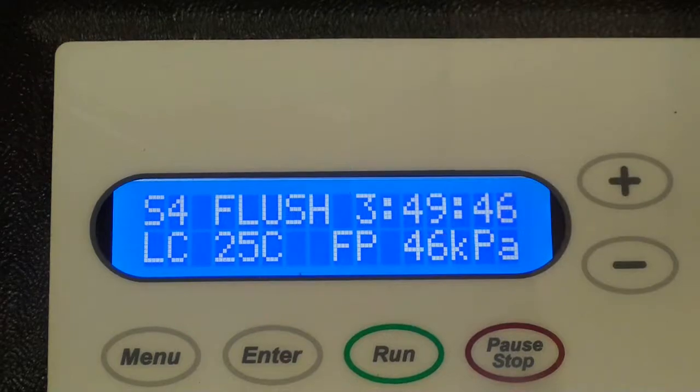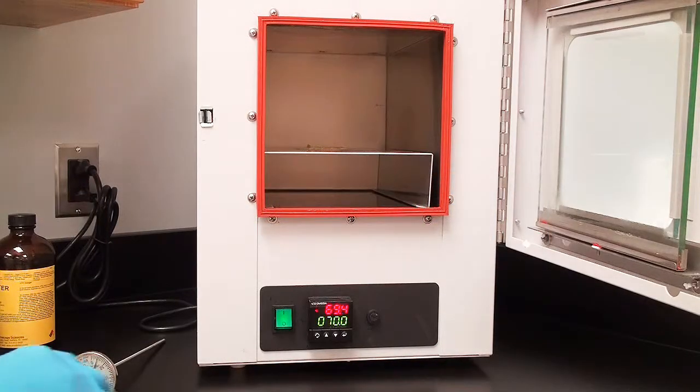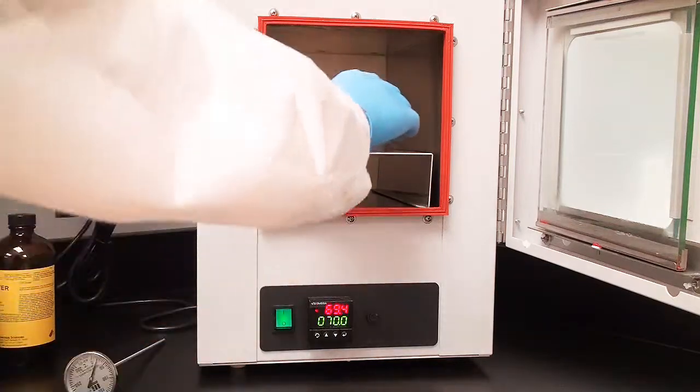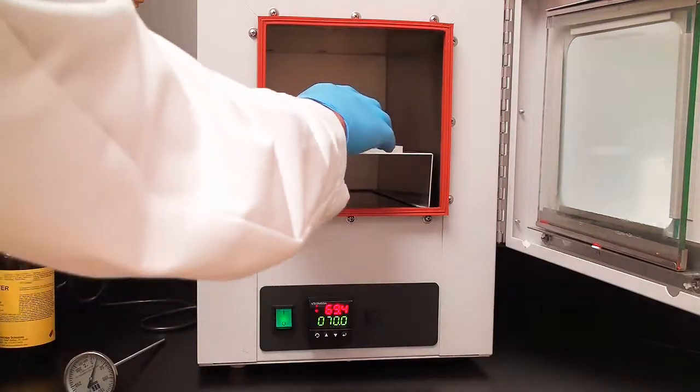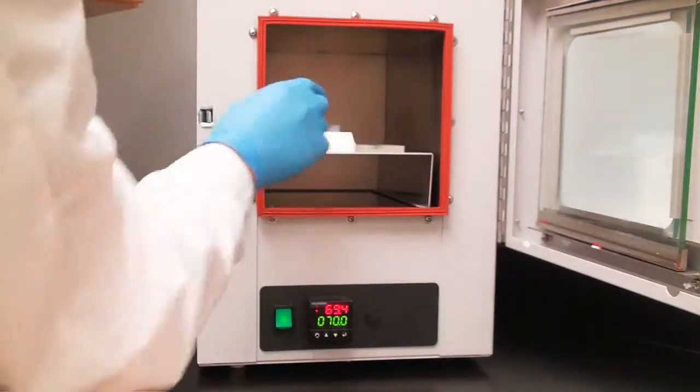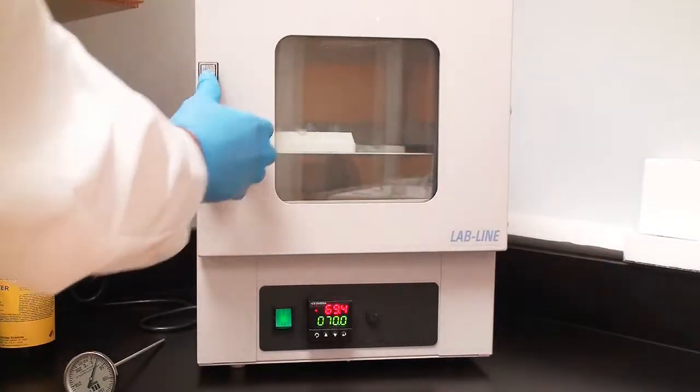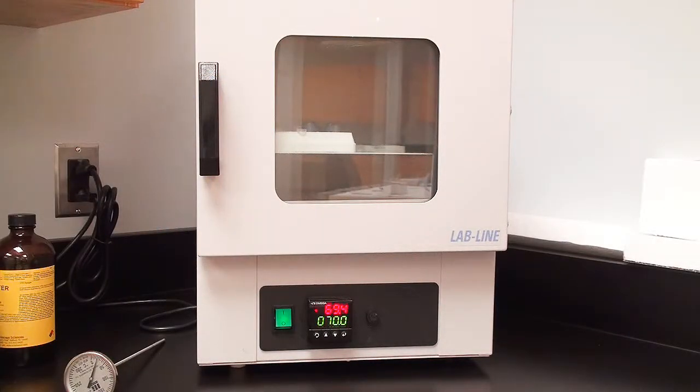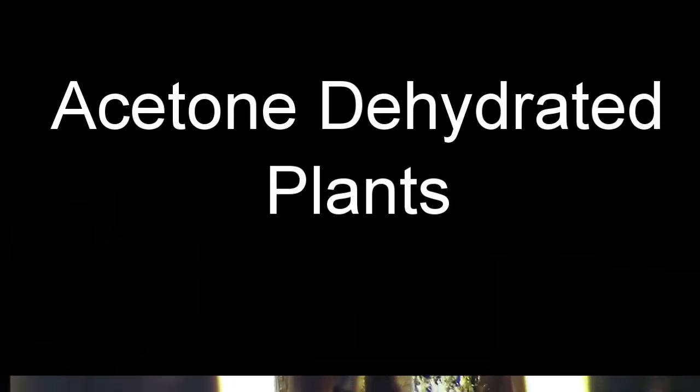So now 32 hours later our samples are all infiltrated and I like to put them in a regular oven. I could polymerize them in the poly 3, but I had to take my samples from the plant and put them in flat embedment molds, and so I just am doing that in the oven. So I polymerized my samples overnight, and I'm going to be looking at the acetone dehydrated plant samples first. The kidneys all look just fine, so I'm not going to worry about those.